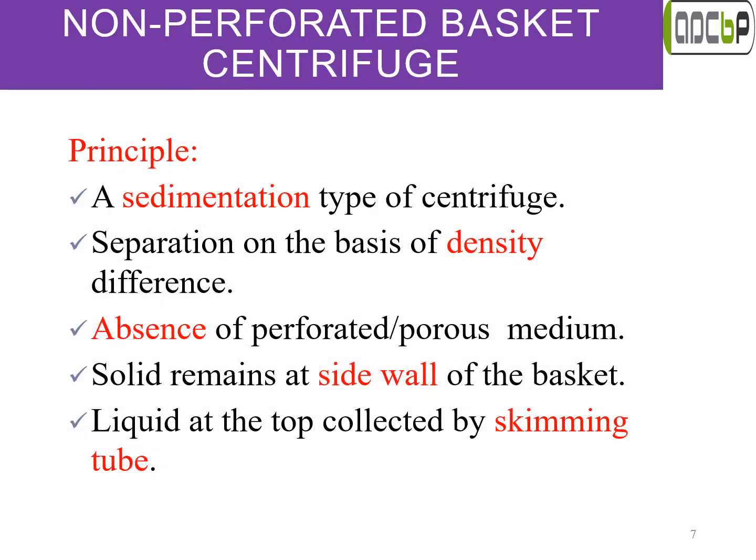Now let us discuss a non-perforated basket centrifuge. As we know, it works on the principle of a sedimentation type of centrifuge, where the separation is on the basis of density difference. As we already know, there are no perforations, or there is no porous medium. So the separation is due to different centrifugal force because of the density difference in the separating materials.